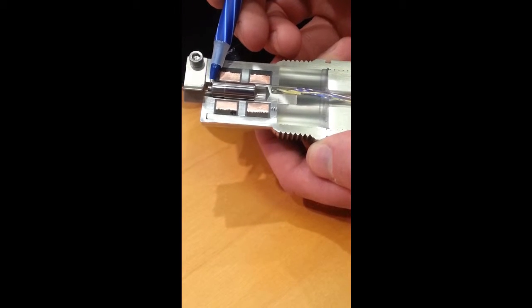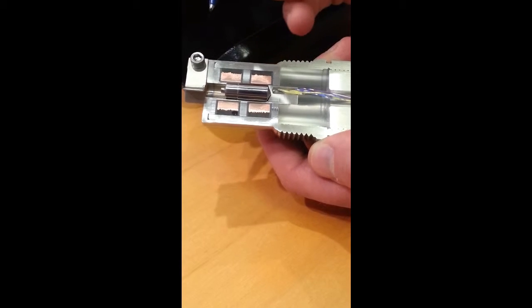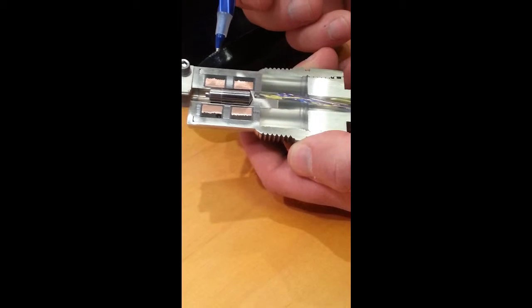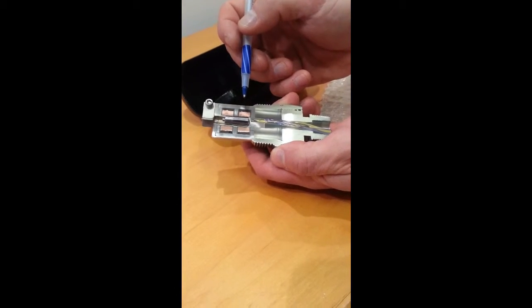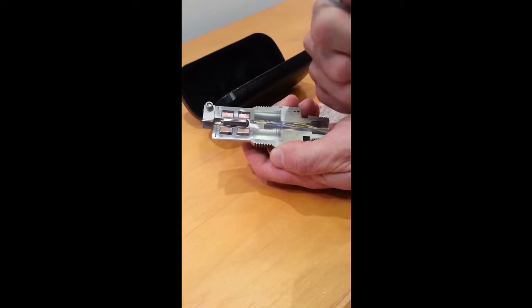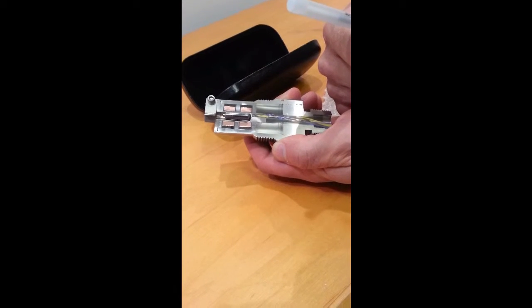And it pulls the piston back through the fluid again with a constant force. The viscous drag of the fluid will determine how quickly or how slowly the piston travels. What we're doing is we're measuring the amount of time it takes that piston to travel between the two endpoints. That amount of time is equal to the viscosity, the absolute viscosity in centipoise.